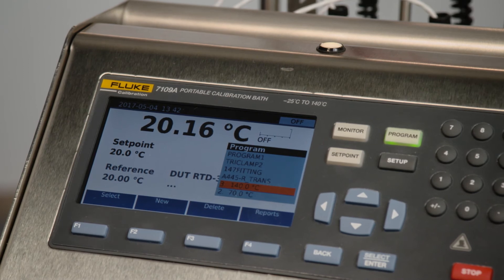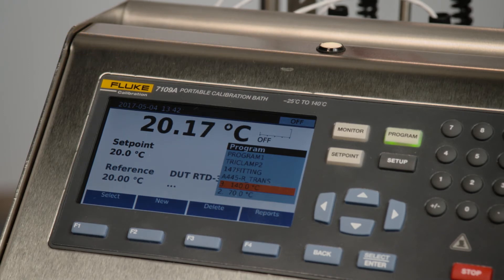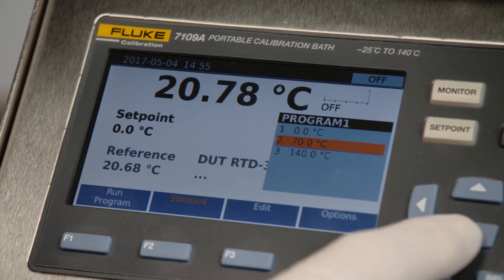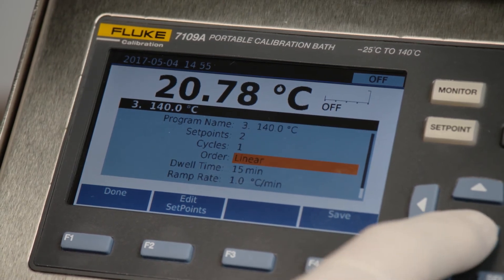In the program mode, you can define several set point temperatures. The 7109A bath has a range of minus 25 to 140 degrees Celsius. For this example, we have defined program one with three set point temperatures: 0, 70, and 140 degrees, with a dwell time of 15 minutes at each set point.